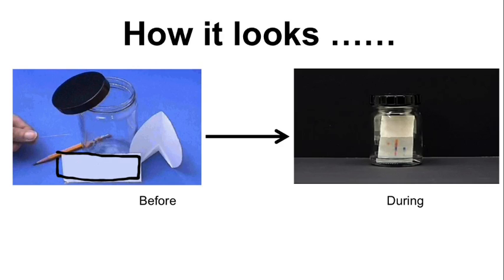Okay? So what you're going to end up doing is getting your compounds put onto your TLC plate, so you can mark where you'll put your compounds, spot your compounds onto it, and then you can go ahead and put it into your wide mouth bottle, which is this guy. Okay? And you'll have a little bit of solvent at the bottom of that. You'll put your plate in vertically. You'll cap it. The solvent will rise up through the plate via capillary action, allowing our spots to move different distances, and we'd end up with our final plate. Okay? Depending on who trains you, you might use a piece of filter paper in your TLC jar as well. That's up to your TA and you. So you can read more about the filter paper or talk with your TA to decide if you want to use that.